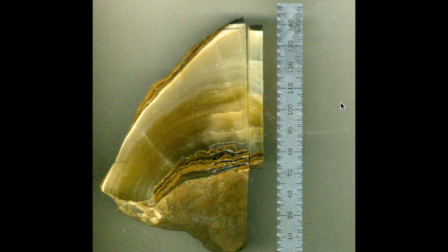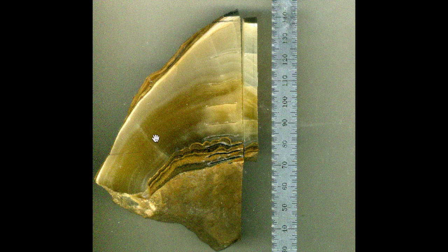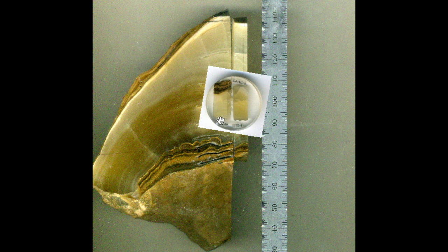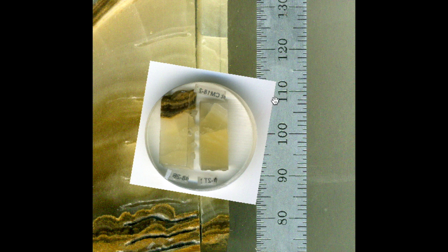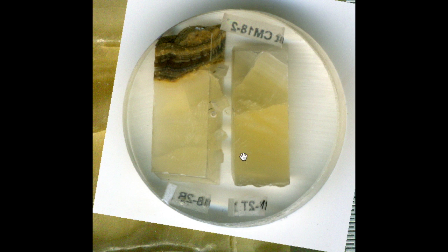Okay, I'm just going to put everything together for you all and show you the power of the SIMS. On the left here is a stalagmite sample from a Wisconsin cave that I'm analyzing for my PhD, which is why you can see I've sliced it respectively, because I will be analyzing it on the SIMS. More specifically, here's my sample mount. Just to orient you all, this is a spatial database, so everything I show you is to scale to this ruler on the right. So here is the sample mount for this specific stalagmite sample.